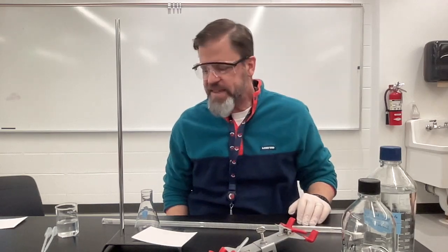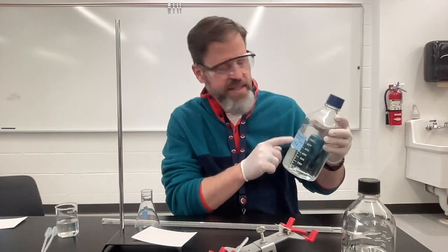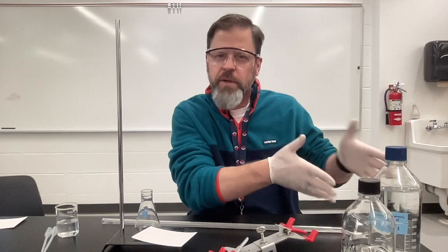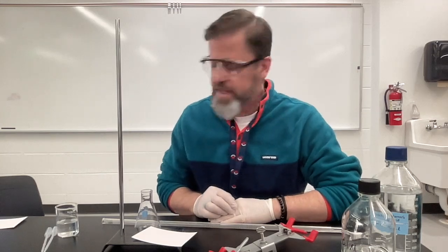Hello students. What we're going to do today in this video is we're going to get a titration setup going for a sample. I have a simulated stomach acid here that I've made, and we really wish we knew what the concentration of this stomach acid was. In order to do that, we're going to perform a titration.